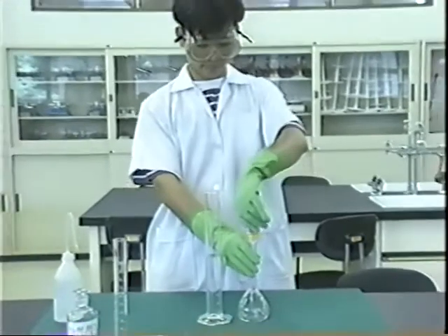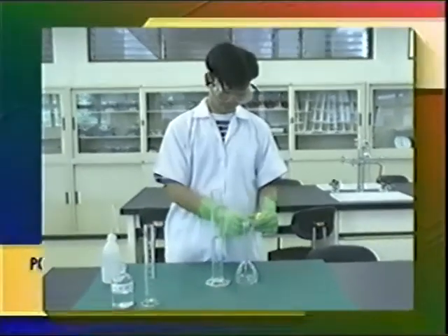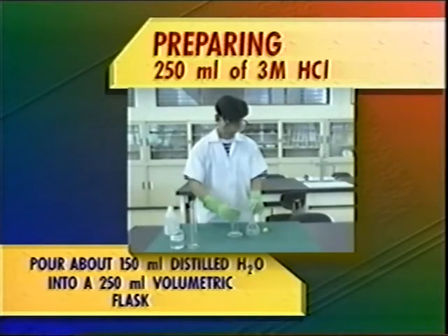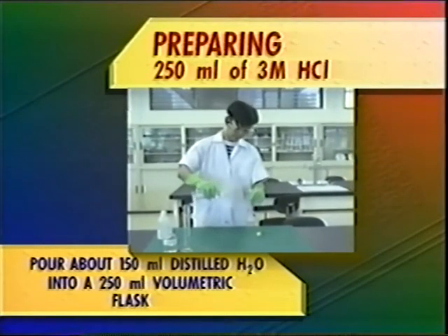James will now prepare this solution. Using an ordinary graduated cylinder, pour about 150 milliliters of distilled water into a 250 milliliter volumetric flask.